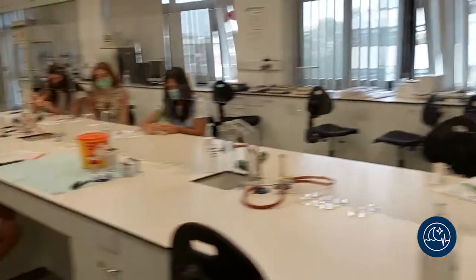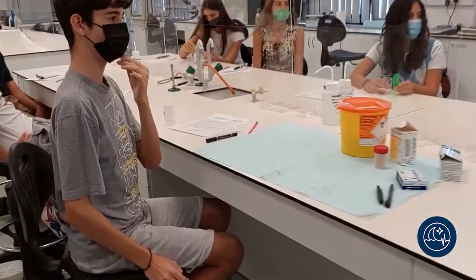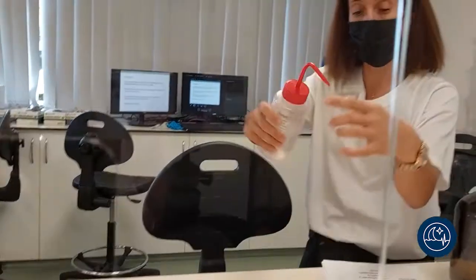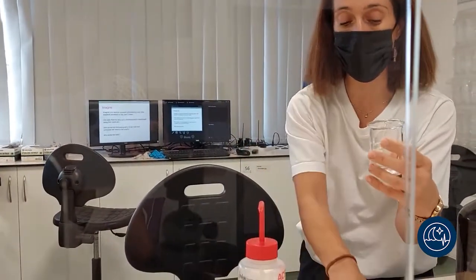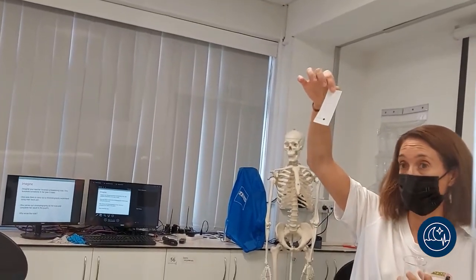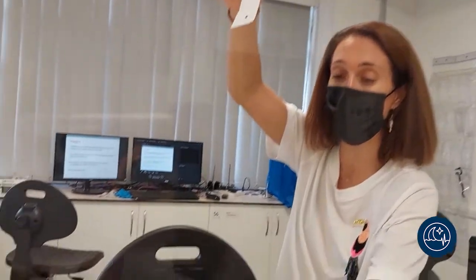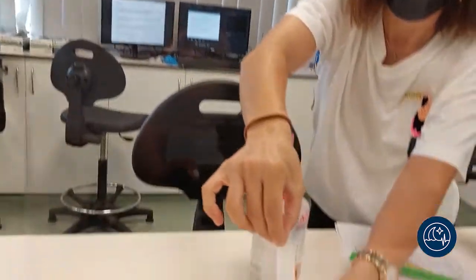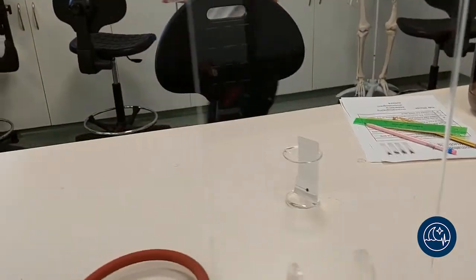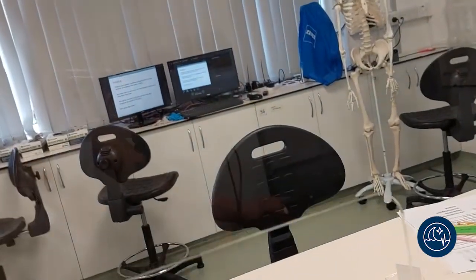This is the acetone. And what I'm going to do, guys, is my experiment, because I have taken a sample of ink from my threatening note. I'm going to place my beaker here, and I'm going to wait and see what pattern I'm going to come up with.